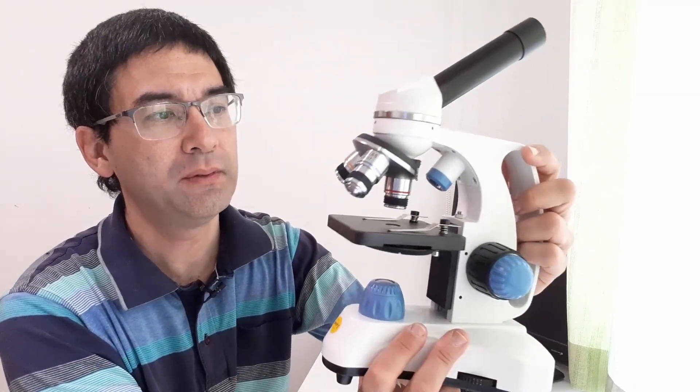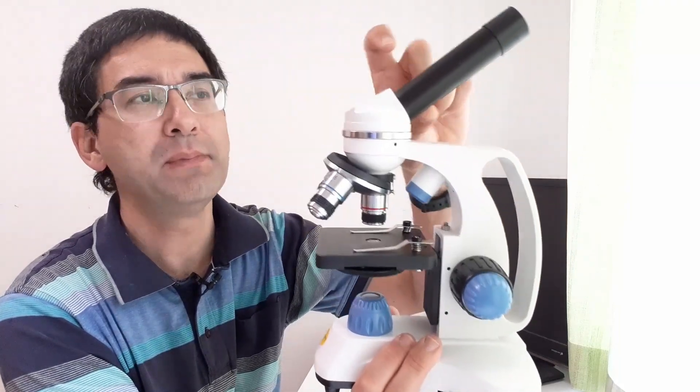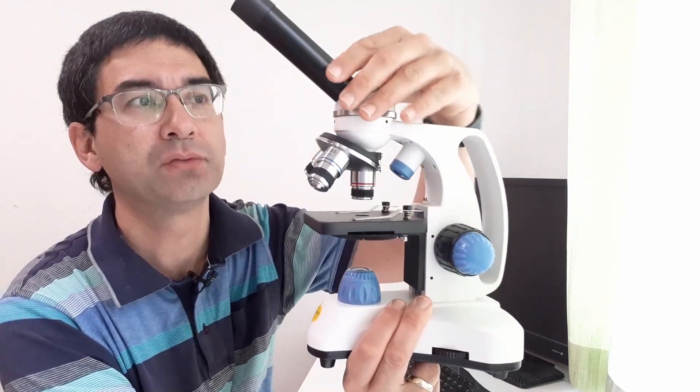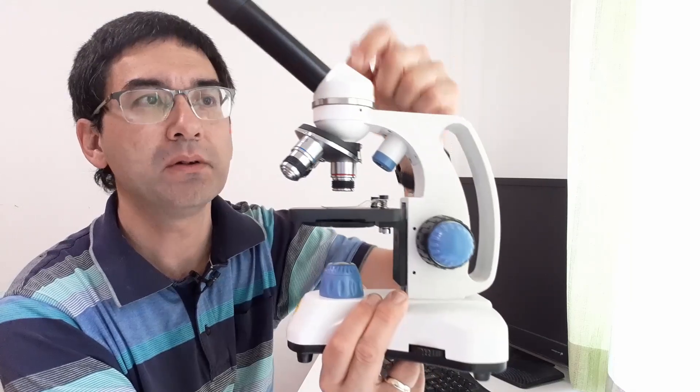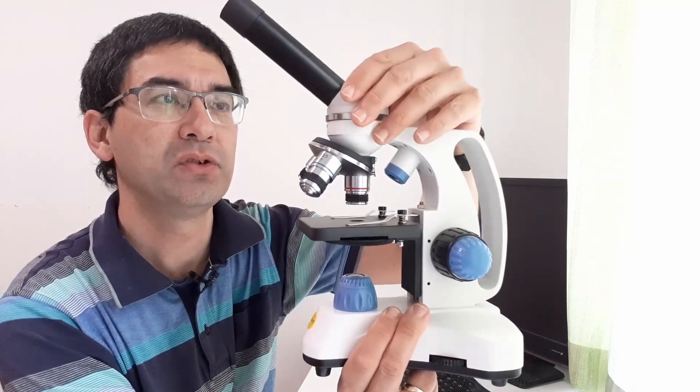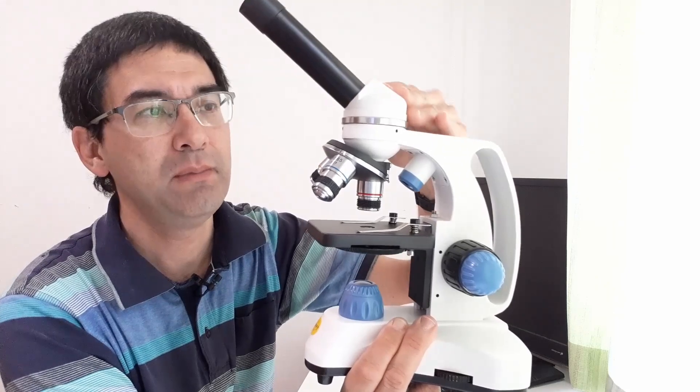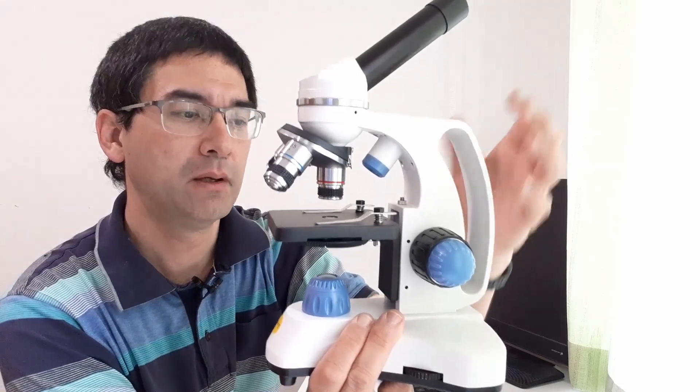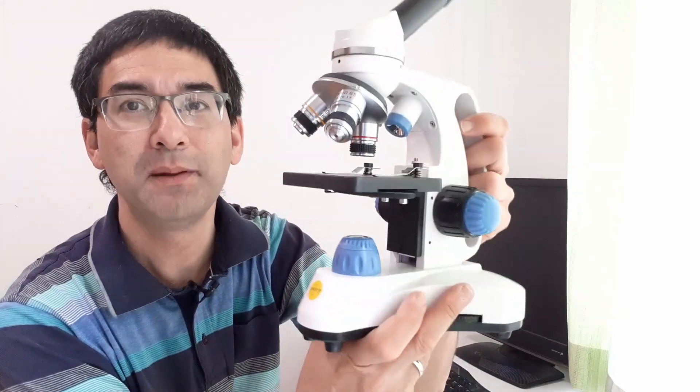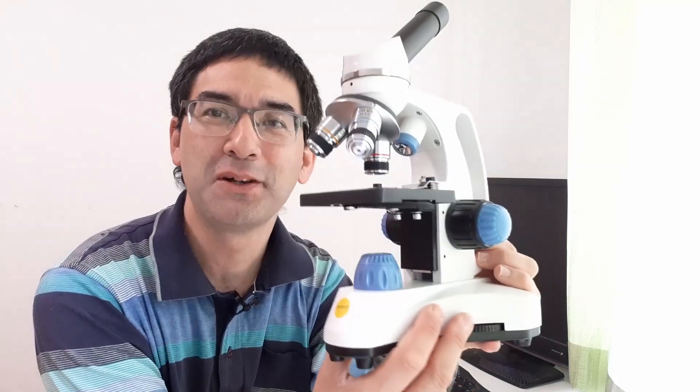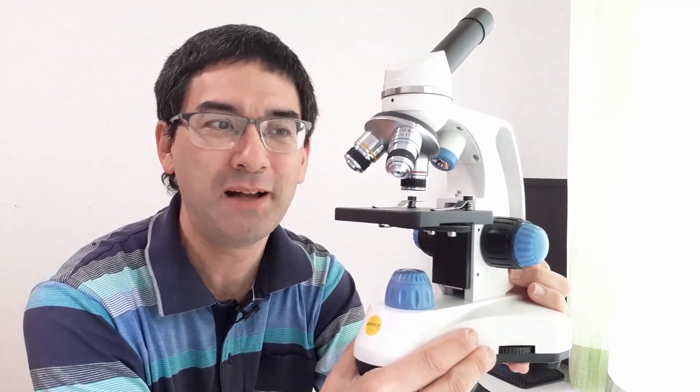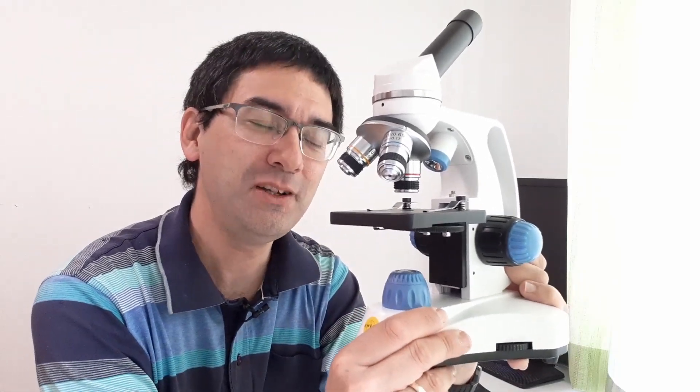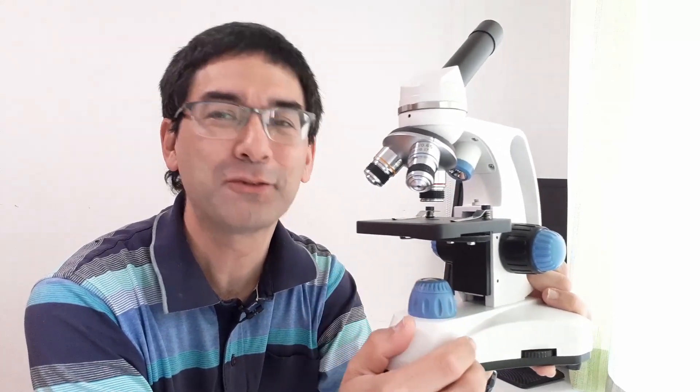First of all, the tube here is made of metal. The head here is made of metal. You can see you can rotate this around, it operates quite smoothly. There is a mirror in here, so you will get an image that is horizontally flipped. The arm is made of metal aluminum. Also the base is made of metal and to my big surprise, the stage is also made of metal. Not that this is particularly important, but it shows that the company takes microscopes seriously.